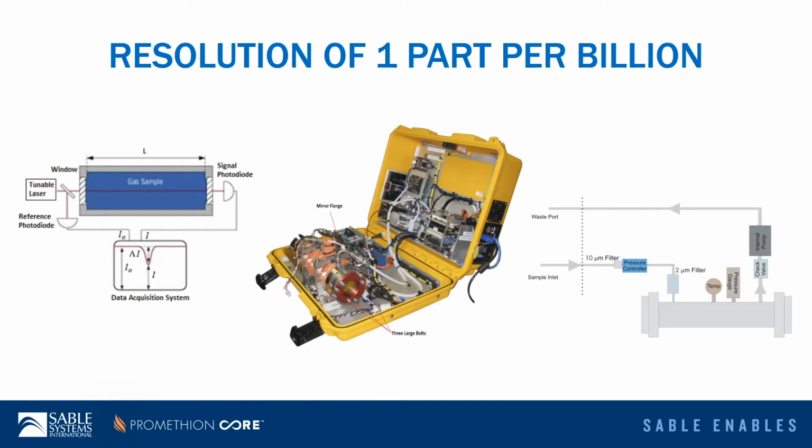So let's take a moment to look inside the methane analyzer, which you should never really need to open. It contains a tunable diode laser set to measure methane concentrations in a gas stream that flows constantly at a rate of somewhere between 300 and 1,000 milliliters per minute.